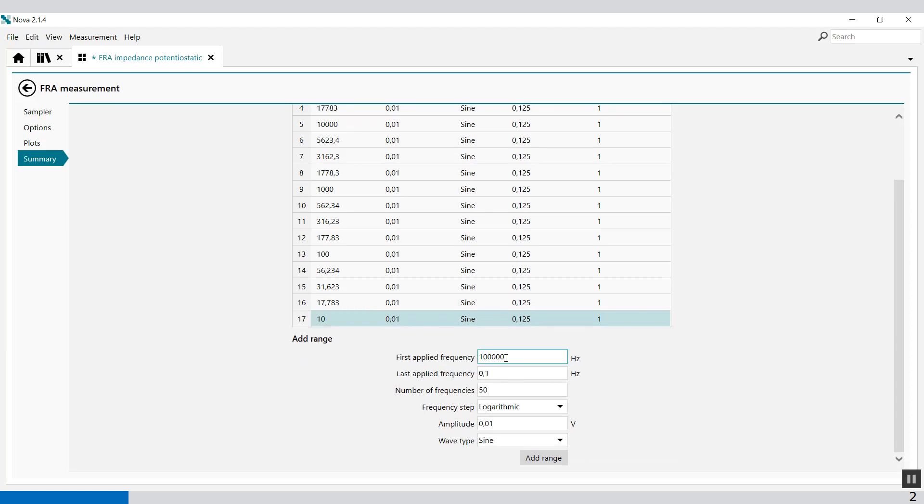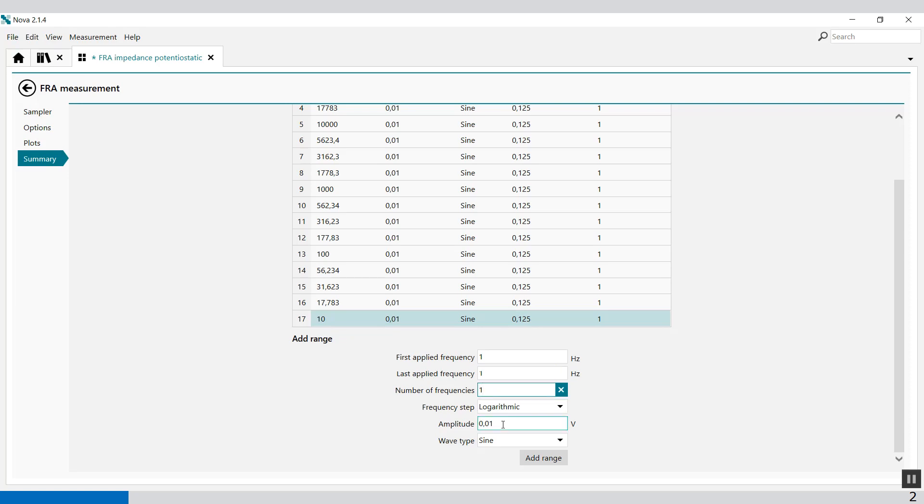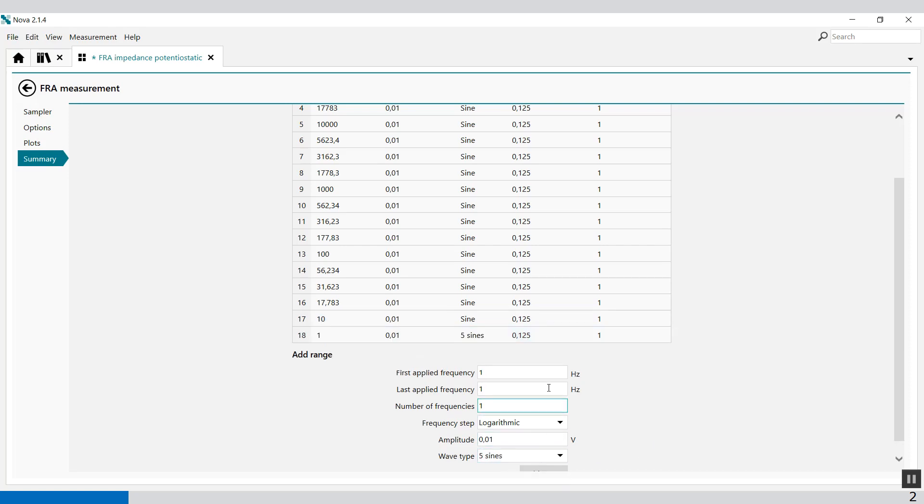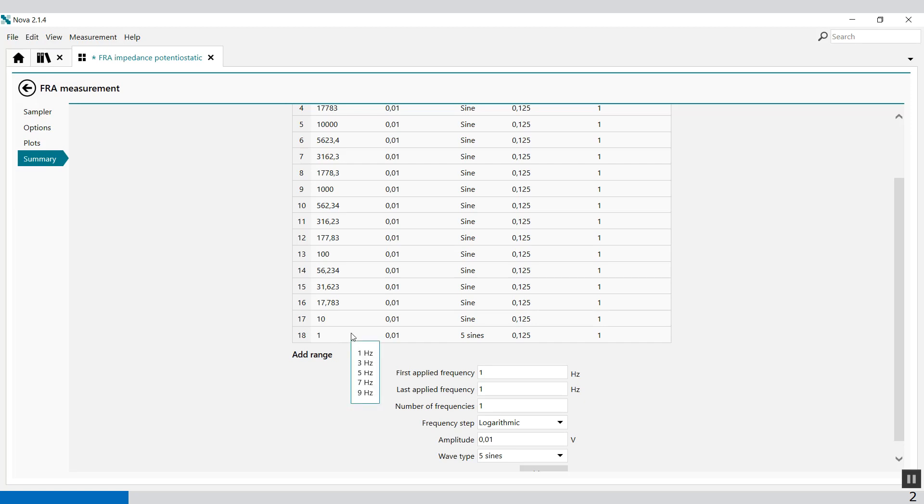You can delete as many frequencies as you want. You can also add ranges. For example, you can add a range from first frequency, let's say one hertz to also one hertz. I'm only using one frequency and I have to have it in five sines. Add range. You'll see that this frequency will superimpose one hertz, three hertz, five hertz, seven hertz, and nine hertz on top of a one hertz base frequency. So we have five sines shot in one go. That's the multi-sine option.